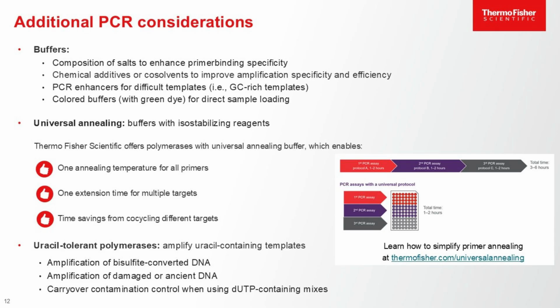This innovation also enables the simultaneous cycling of shorter and longer amplicons using the same extension time and allows different PCR assays to be run together using a single protocol. Another important thing to consider is uracil-tolerant polymerases. Uracil-tolerant polymerases are specialized enzymes designed to amplify DNA templates containing uracil, which can be challenging for standard polymerases.